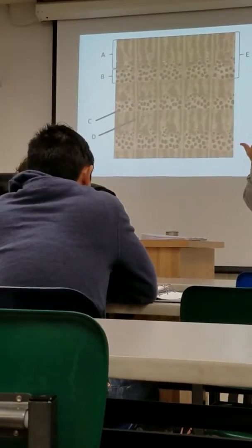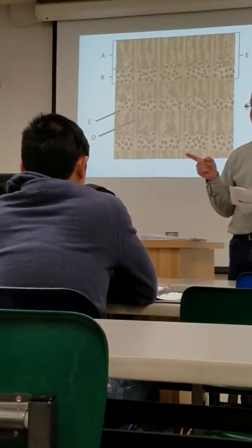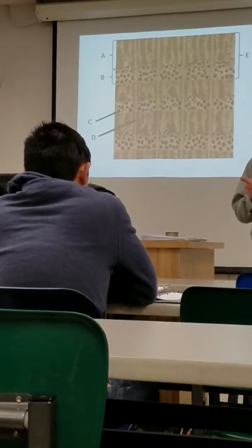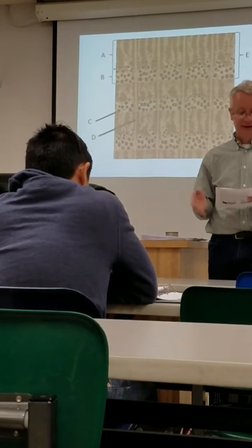Corn is a monocot, right? There's a microscope with a Picea, a spruce cross-section. There's a microscope with an oak cross-section. These are all labeled with strips of paper in front of the microscope to tell you what's on there.